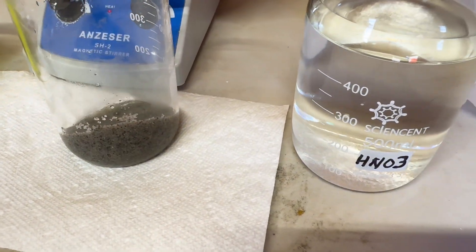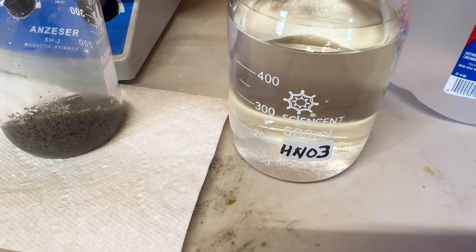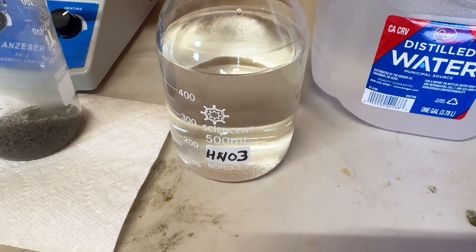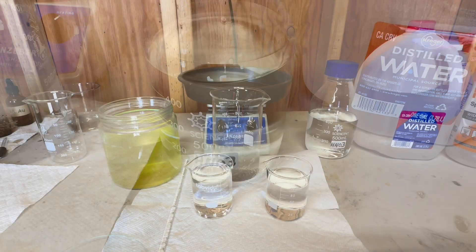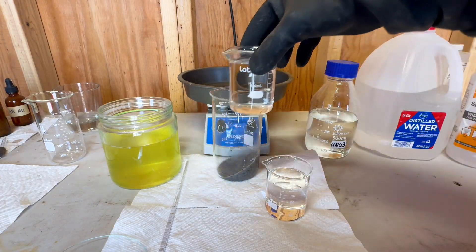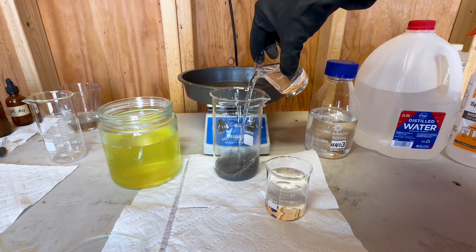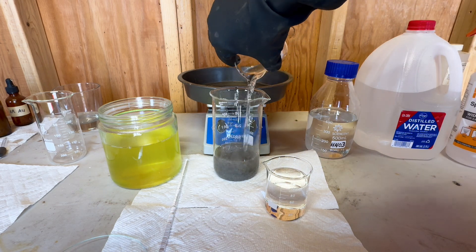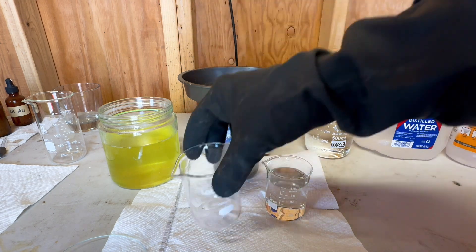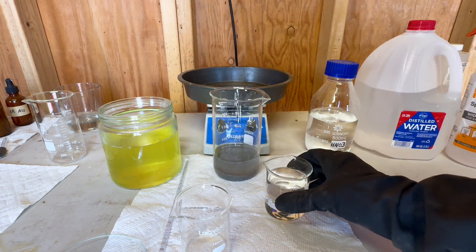Now we will clean our concentrate with some HNO3, otherwise known as nitric acid, and distilled water. We will wash our concentrate with 50% nitric acid and 50% distilled water. The nitric acid will remove copper, silver, and any other base metals that might be in our concentrate.